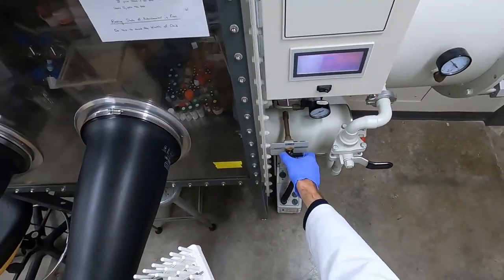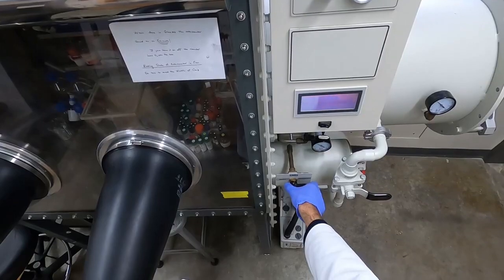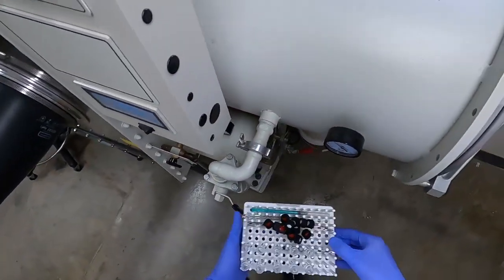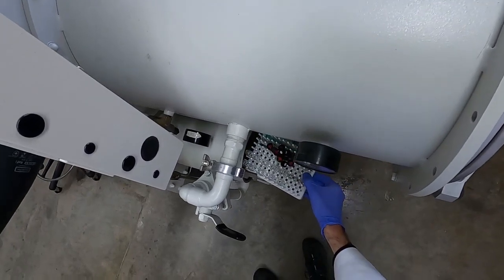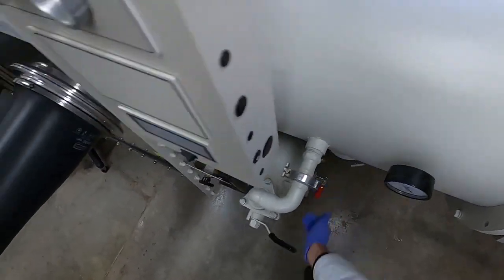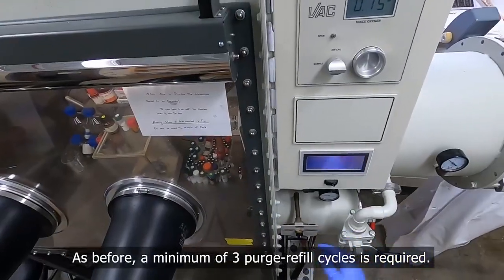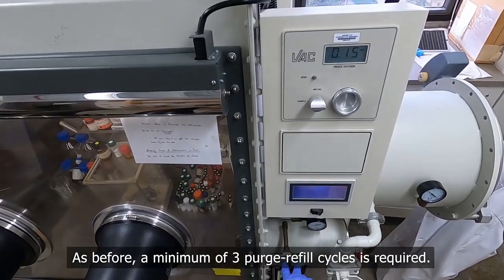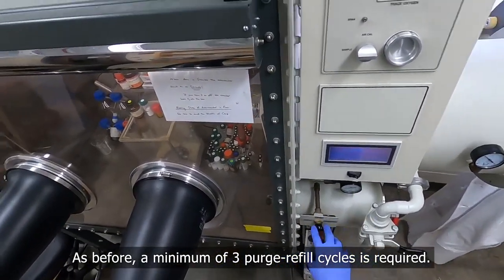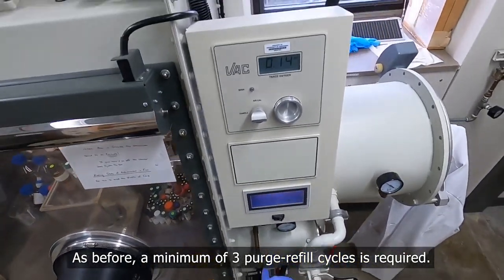So we have our knob here, we'll turn that to refill. I'll go back and forth 3 to 4 times, and on the very last time that I go to evacuation, that's when I'll let it sit for a good 10 to 15 minutes.